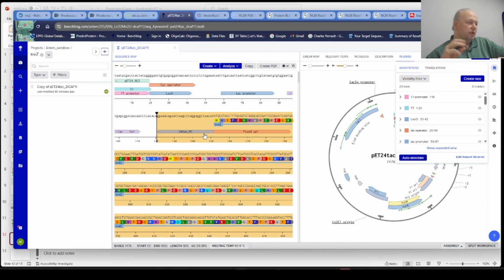Then the nuclease will digest it from one end, digest it from the other end. The two single-stranded regions will then be lined up. Polymerase will fill any gaps, and then E. coli will ligate the bits.